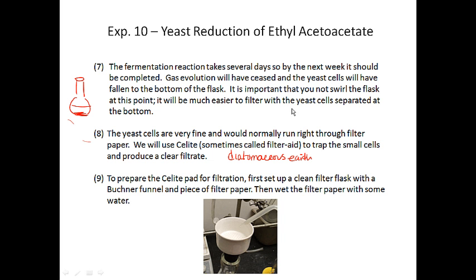And it's exactly as it sounds. It's made up of little diatoms, so if you study those in biology or research, then that's exactly what this is made up of. So what we do is we have to prepare a pad of Celite in a Buchner funnel in order to filter out all the yeast cells.